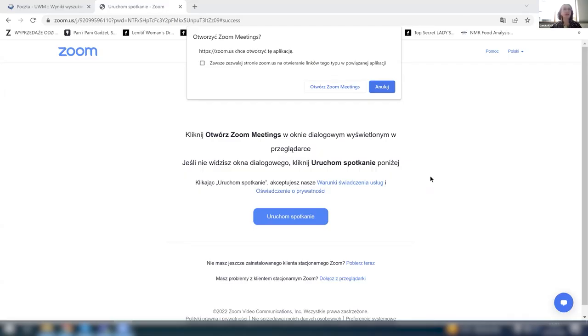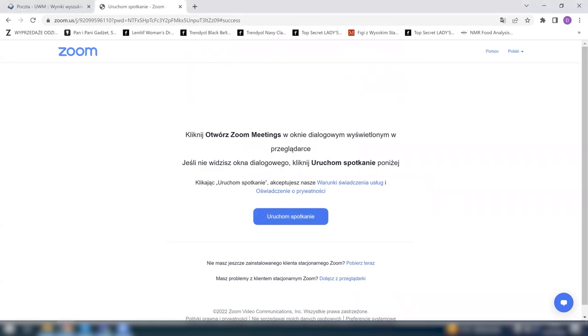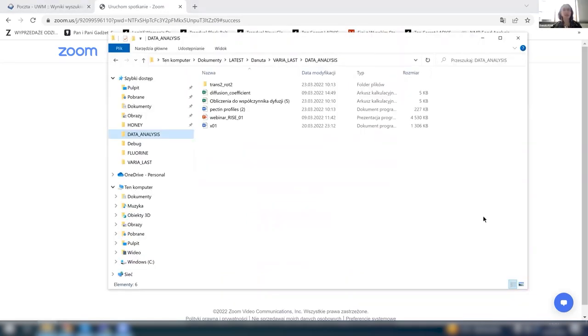So for the sake of the recording, we'll continue the considerations from the previous meeting, and we will shift from theory to some practical applications and try to get a feel for some data. So let me share screen. Okay, so I think you now see my screen. Yes, we do.